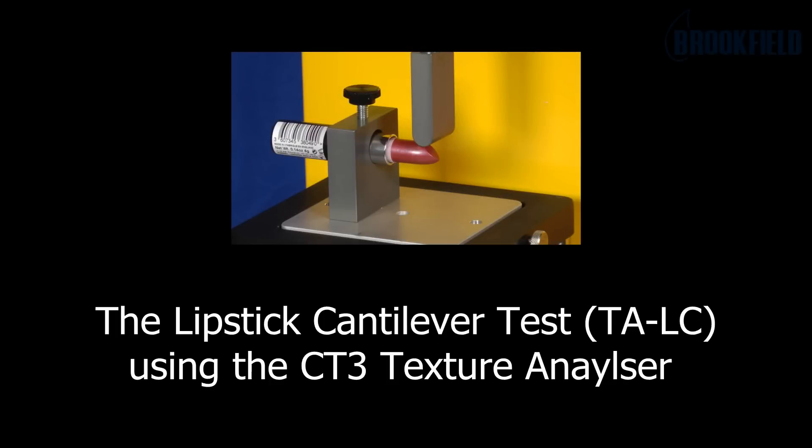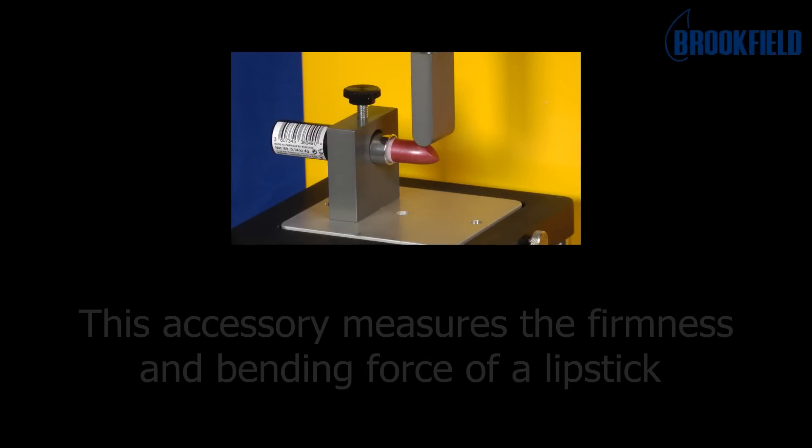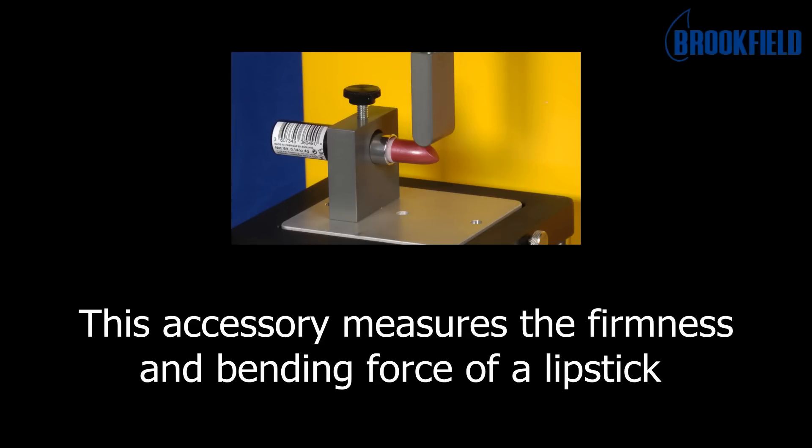This is the lipstick cantilever test using the CT3 Texture Analyzer. This accessory measures the firmness and bending force of a lipstick.